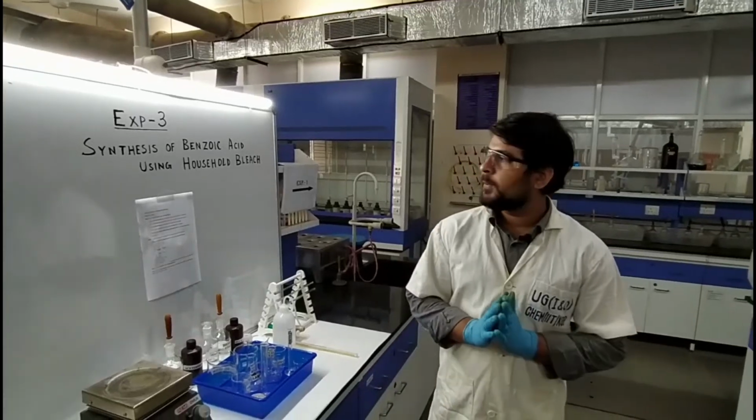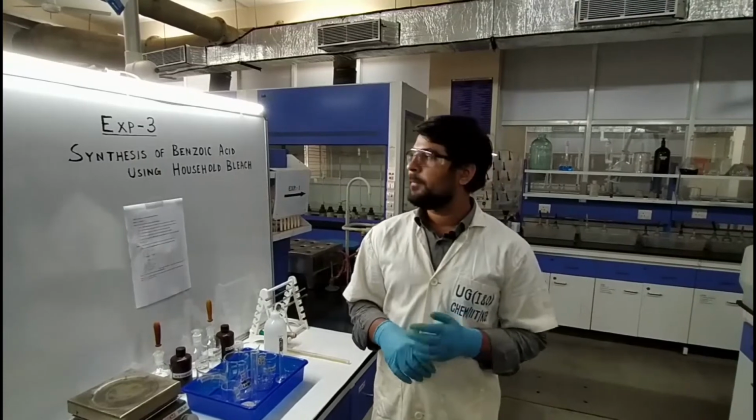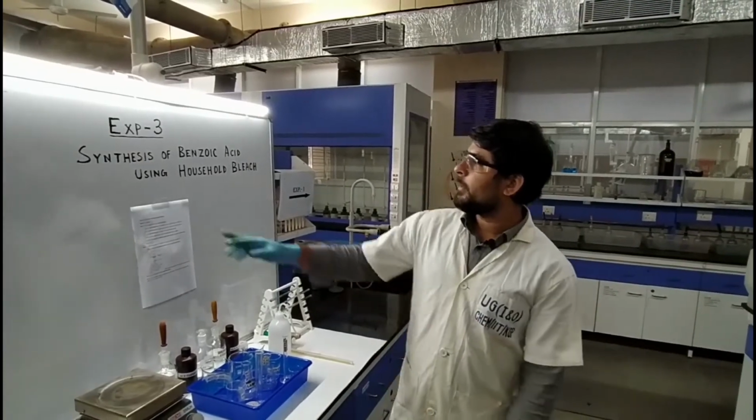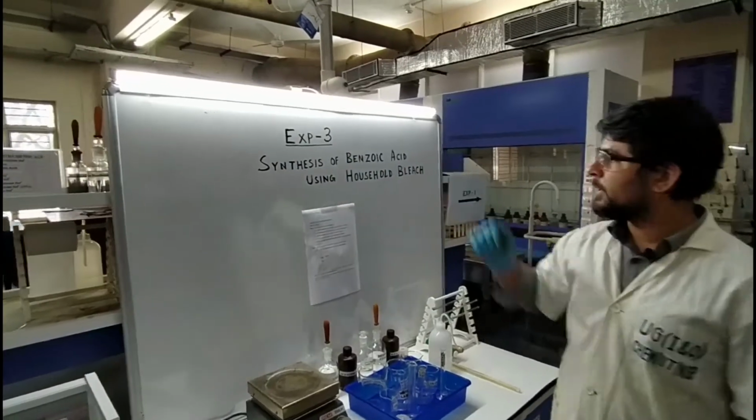Hello student, today I am going to show you another experiment of the organic lab, that is experiment number 3. What is experiment number 3? Synthesis of benzoic acid using household bleach.